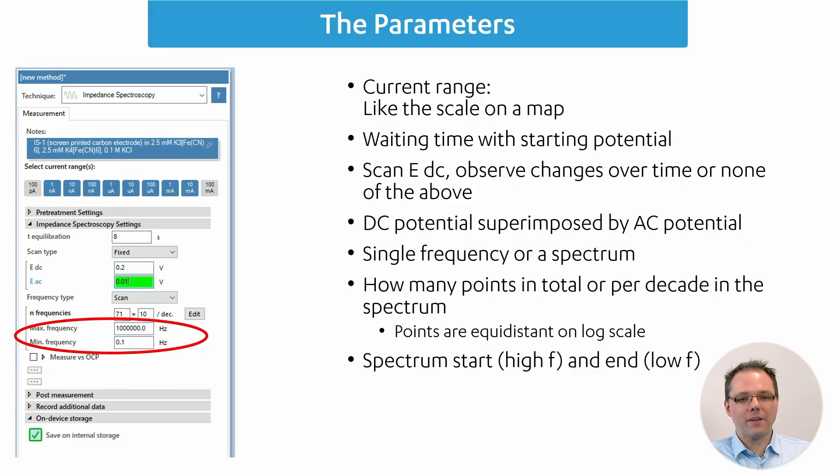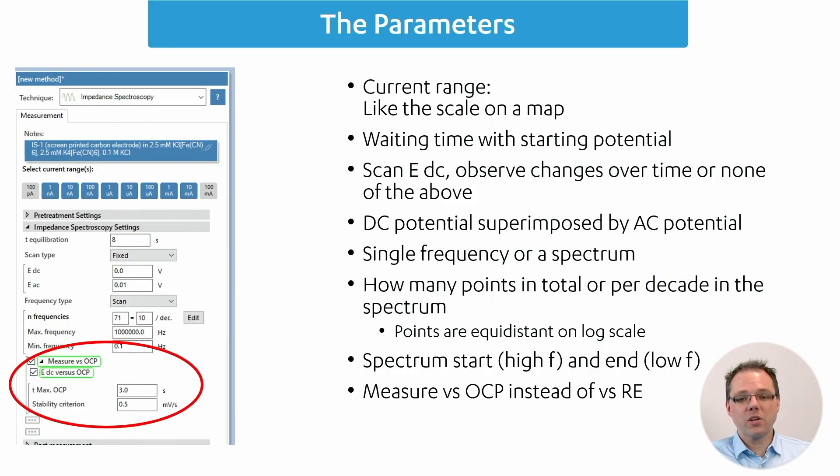The last option that we have in the standard is measure versus OCP. This makes the difference if you want to measure where the potentials you put into the software are usually versus the reference electrode. If you now choose the option measure versus OCP and EDC versus OCP, that means if you set a zero in the EDC window, your measurement will be performed at the OCP, the open circuit potential.